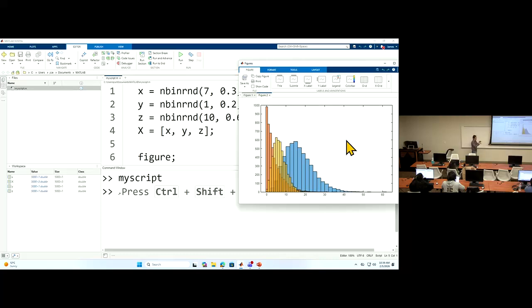Anything you tried in your command window which you believe is valuable, you should copy and save somewhere. So next time you can rerun it, instead of retyping it. For a long script, long code, you don't want to retype it. Here we regenerate X, Y, Z and put them together. We regenerate this figure to show the histogram, the distribution of those three genes' expression.